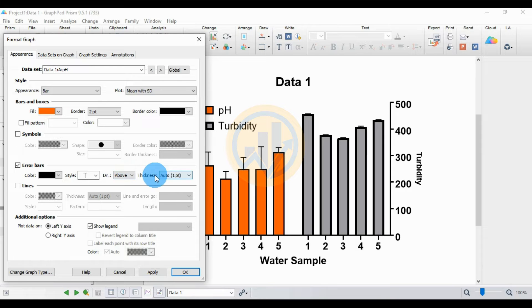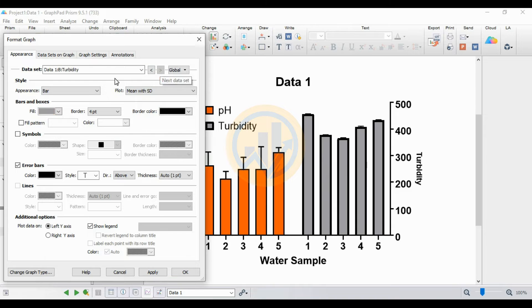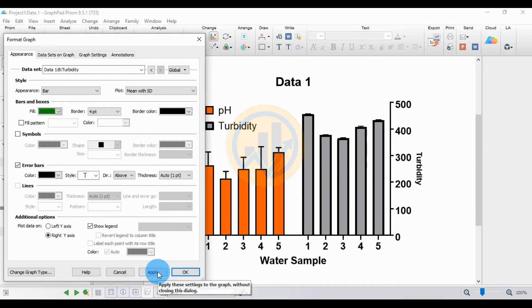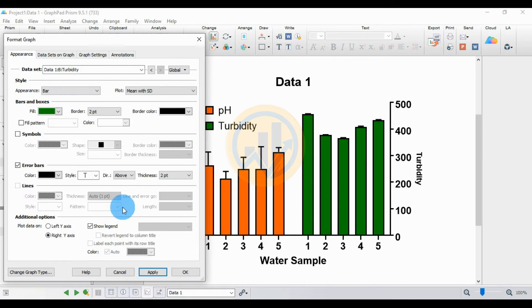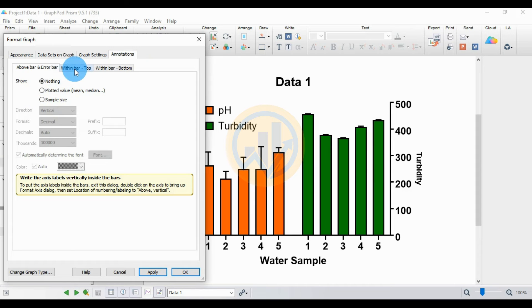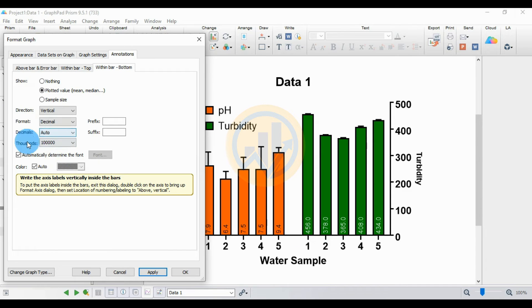Set the error bar thickness to 2. Next, for the turbidity dataset, apply customization. Select the turbidity dataset, change the bar color, and click Apply. Set the width to 2 and click Apply. Set the error bar width to 2 as well. For the last option, select 'Announce,' then set 'Within bar top' and 'Within bar bottom.' Select 'Within bar bottom,' then set the plot value to mean. Click Apply.